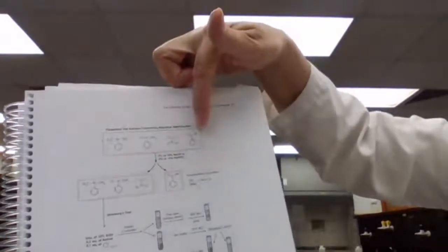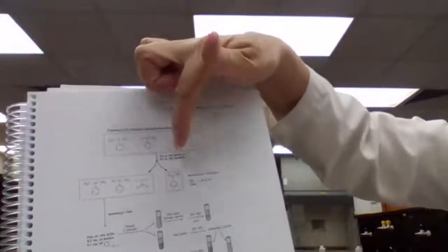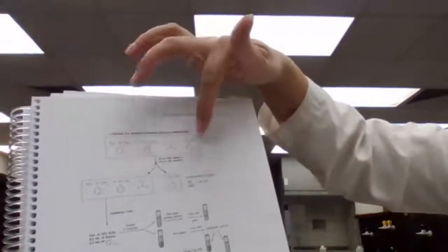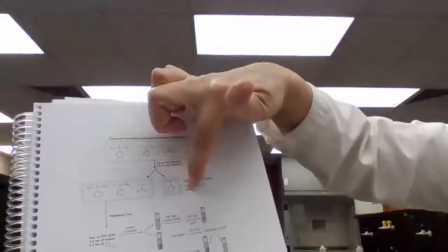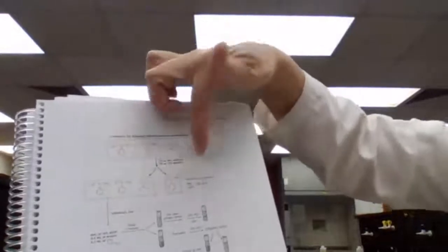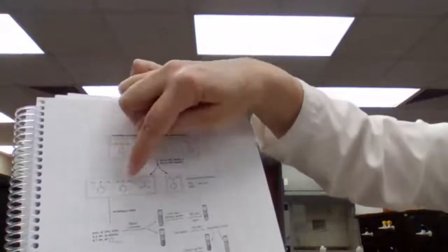If it's not amine, let's say if it's carboxylic acid, it's going to dissolve in sodium hydroxide, then dissolve in sodium bicarbonate. So if my unknown is carboxylic acid, I know based on the solubility that if it dissolves in sodium hydroxide, then it's not going to be amine. If it's amine, it will not dissolve in sodium hydroxide, it will dissolve in HCl. So after we know the functional group is amine, we do the Hinsberg test.